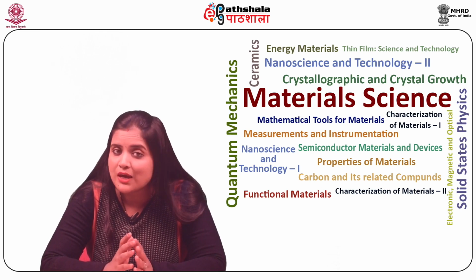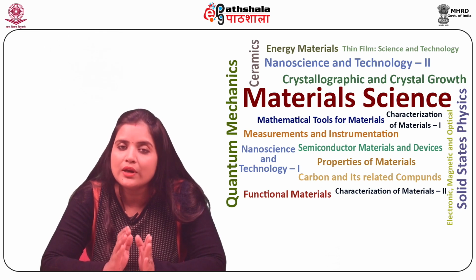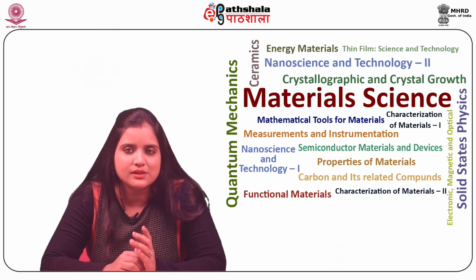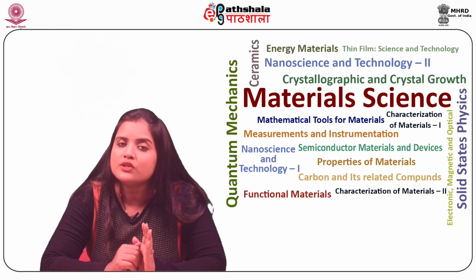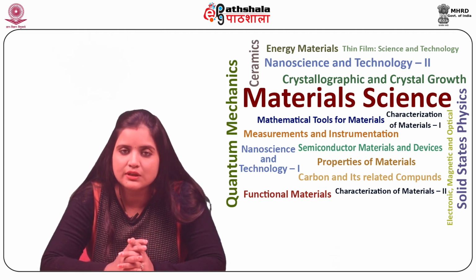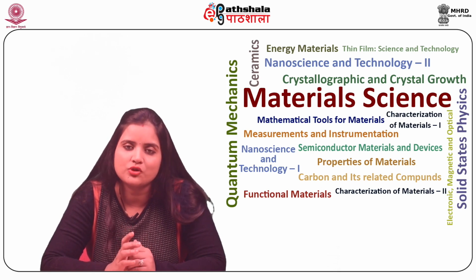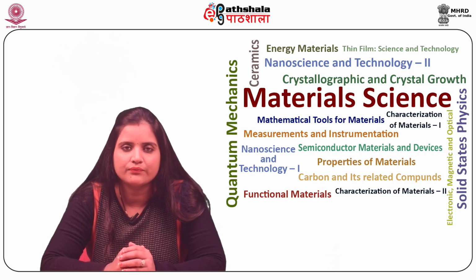Presently, SPM is one of the most employed techniques in various disciplines, which include fundamental surface science, routine examinations of the surface roughness, and three-dimensional imaging from the atoms of silicon to microscale projections on the surface of a living cell.